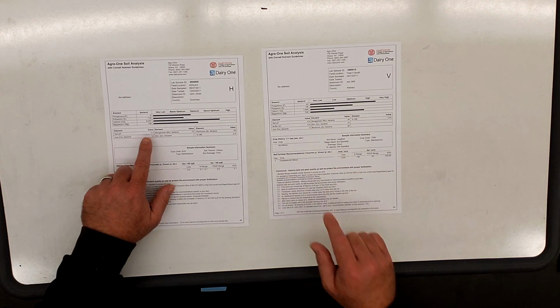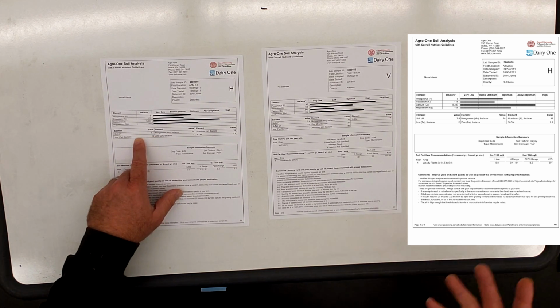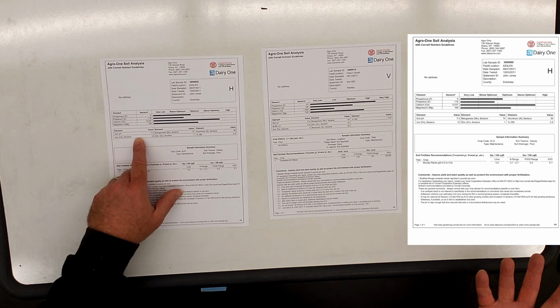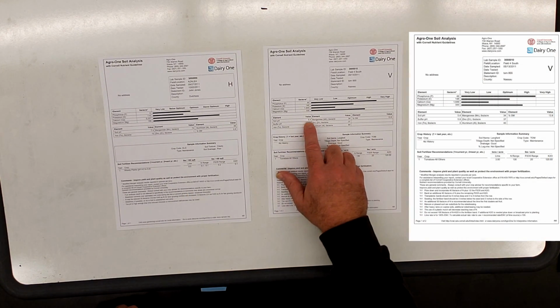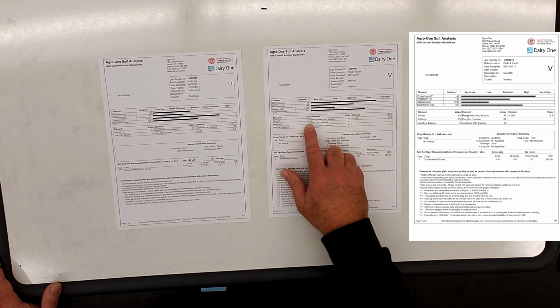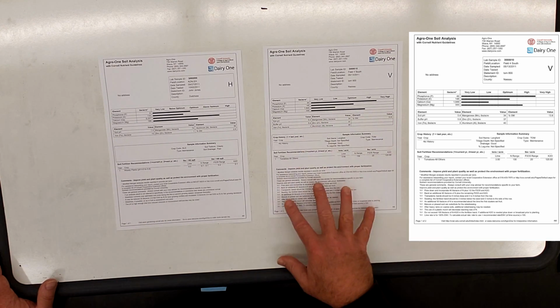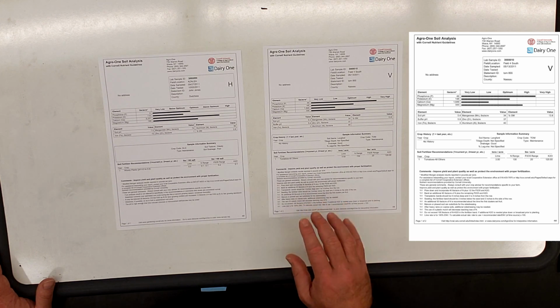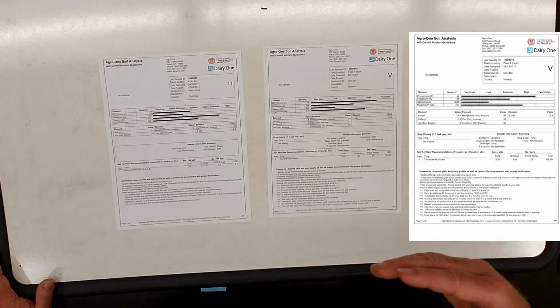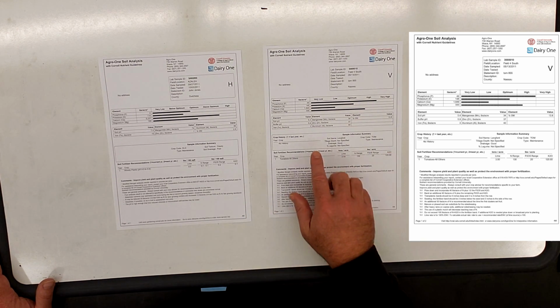But you'll notice that the homeowner one doesn't have that. That's because in this case, they don't feel that there is a real concern that you need to change the pH. In this one, we're going to be growing tomatoes, and a pH of 5.4 for tomatoes is probably not in the optimum range. You probably want to have it at a minimum 5.9. Now, they will talk farther on, and we'll talk a little bit later about how you will actually manage for that. But right now, this is just what the results are.